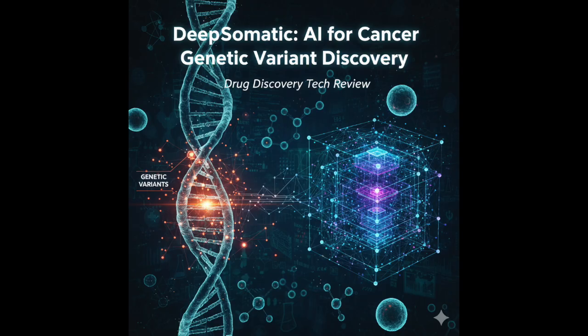Once it finds a candidate site, it generates this special data structure, technically a tensor, but we often call it a pileup image. The pileup image. Tell me more about that. What does it actually look like? This sounds key to how DeepSomatic leverages both samples.